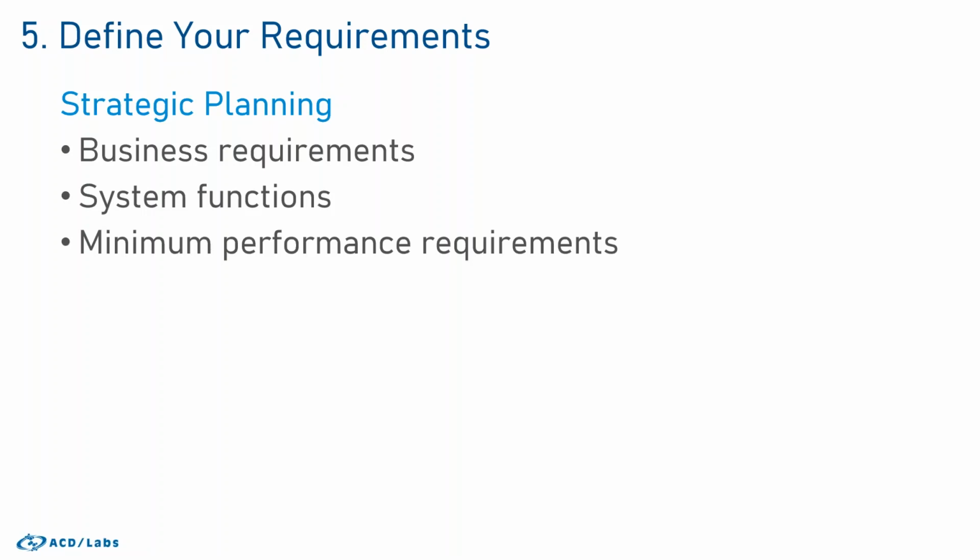And these have to be realistic. If you have, let's say, a 2 gig high-res LCMS data file that's located on disk on a workstation, you can't expect that data file to be transferred to the cloud within 30 seconds, including processing and having that data be available. So keep in mind realistic system performance requirements.